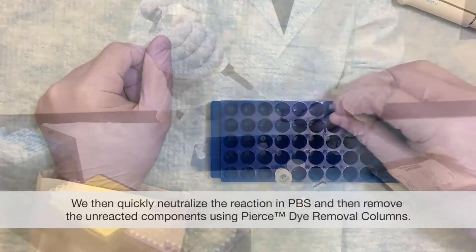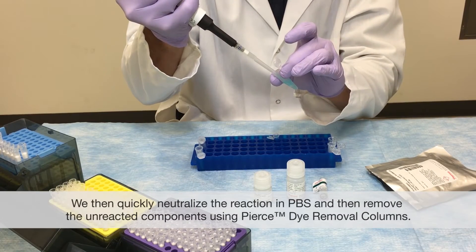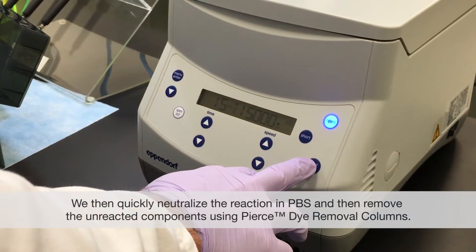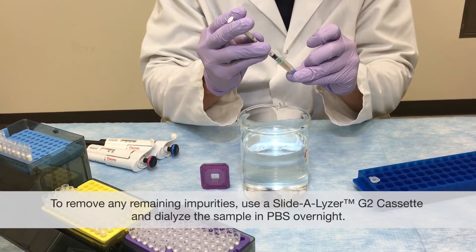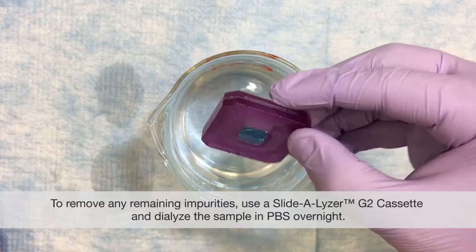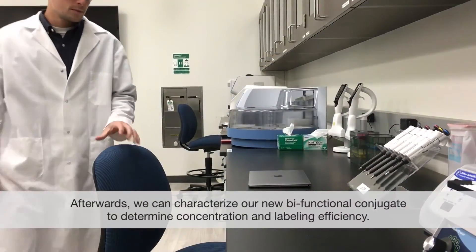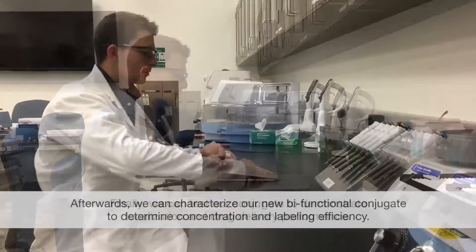We then quickly neutralize the reaction in PBS and remove the unreacted components using Pierce dye removal columns. To remove any remaining impurities, use a Slidealyzer G2 cassette and dialyze the sample in PBS overnight. Afterwards we can characterize our new bifunctional conjugate to determine concentration and labeling efficiency.